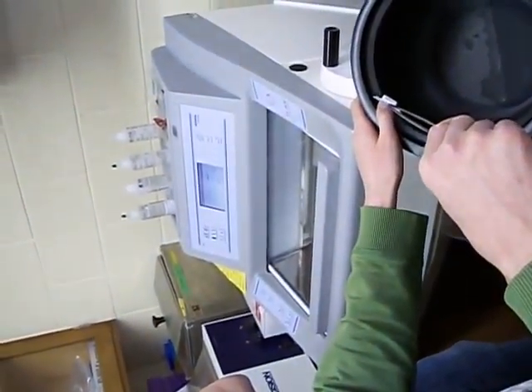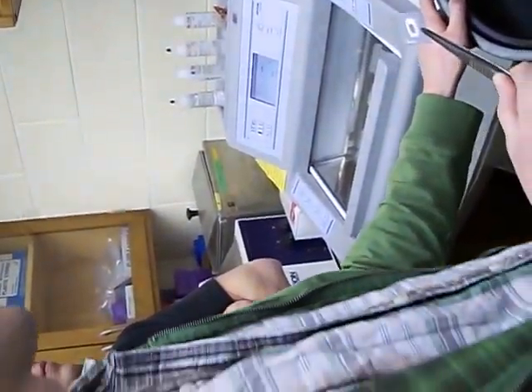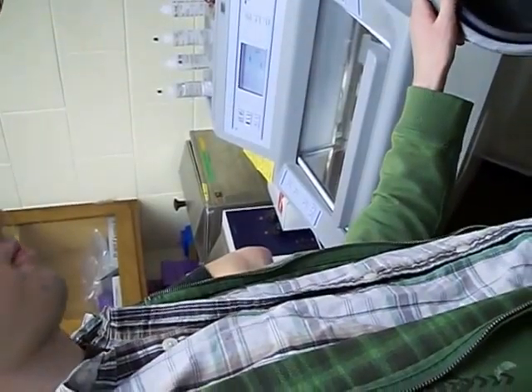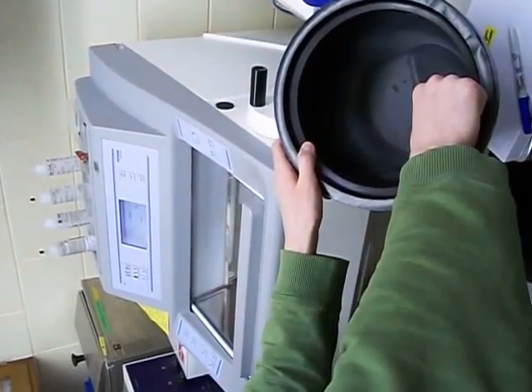Did you set it at minus 32? Yeah. I'm signed up for this machine right now. You're signed up for it. One, two, three, four, five.